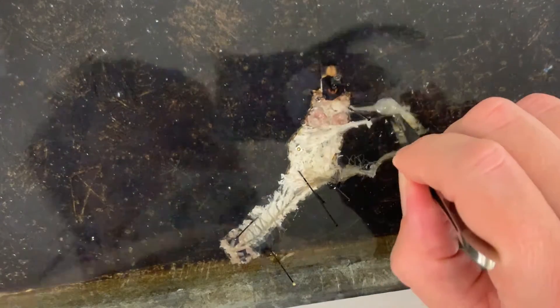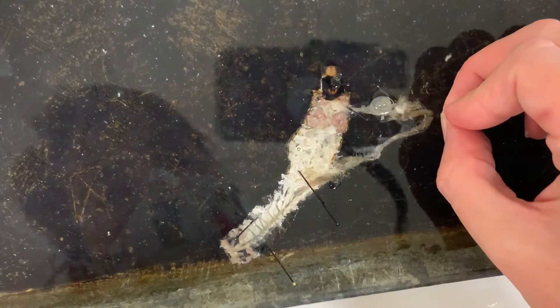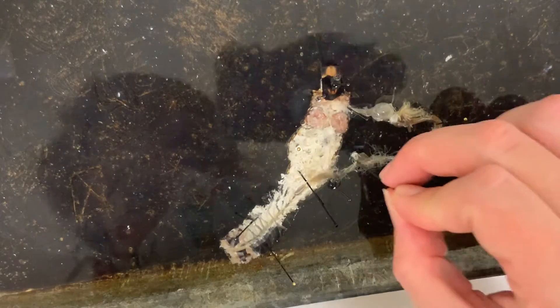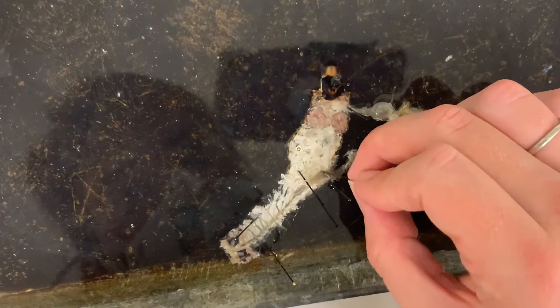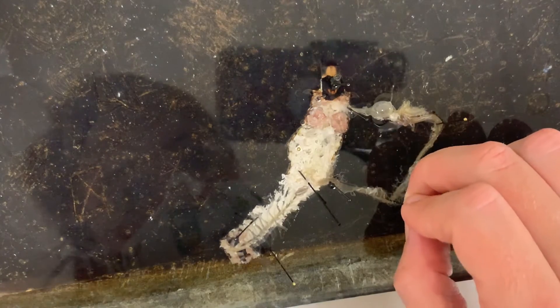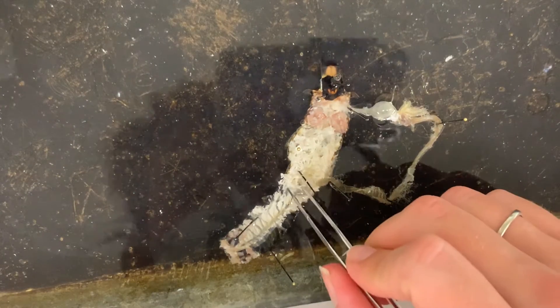Go ahead and pull that all out. What are those down there? That's right, it's the Malpighian tubules, which goes into the hindgut and then out the back.